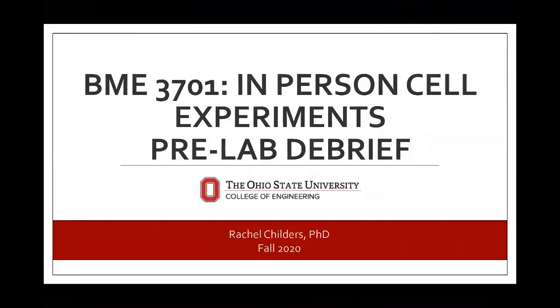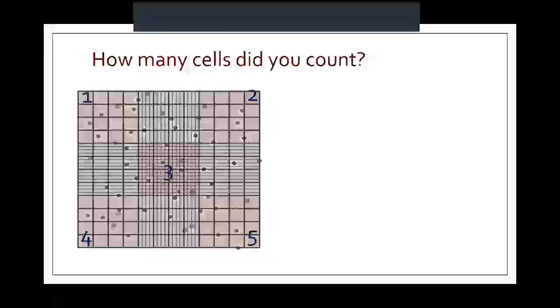Hi guys, I just wanted to make a brief video to debrief the pre-lab for the first in-person lab, which is going to be the cell experiments. So the first part of the pre-lab was cell counting with a hemocytometer.